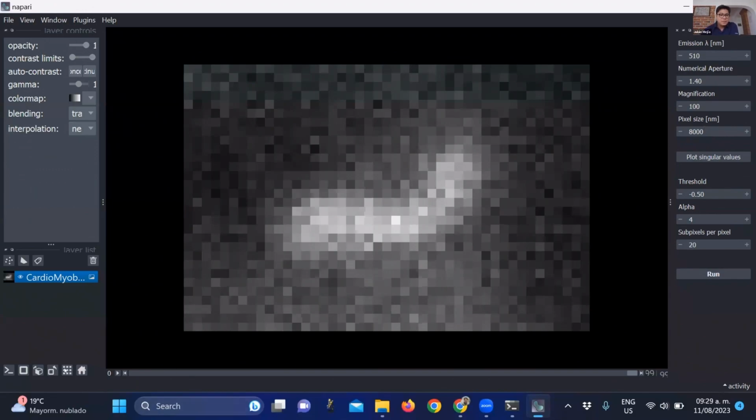Sorry, as I said, this is the pixel size of the camera. And this might be a parameter that is difficult to find or to get if you are not really into the lab or you don't have really good communication with your technician in the lab. That is something that can be improved with all kinds of methods, and I will comment on that later on.